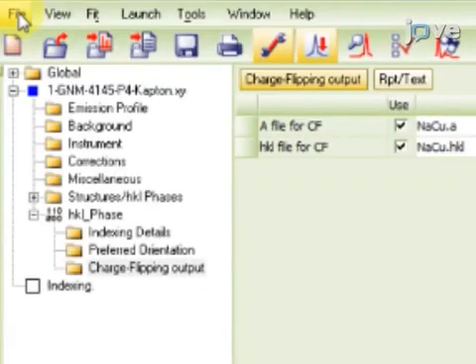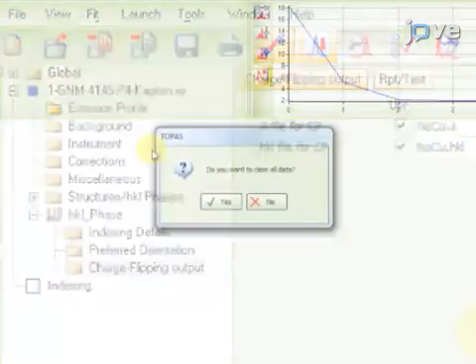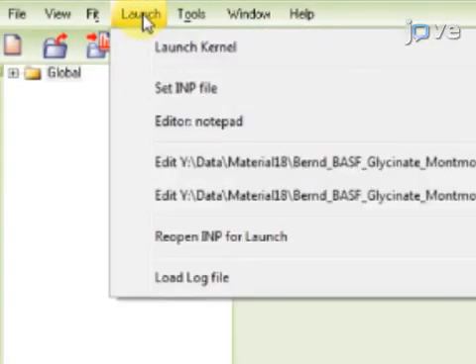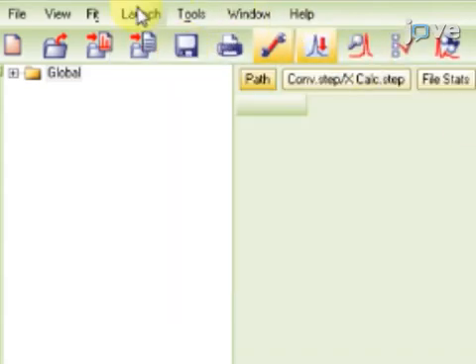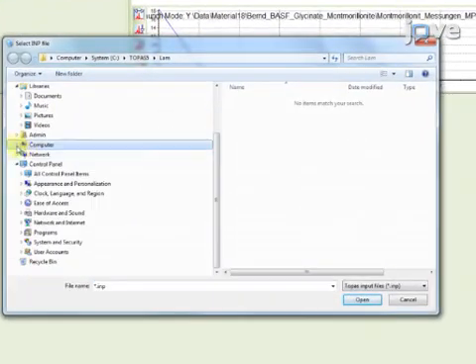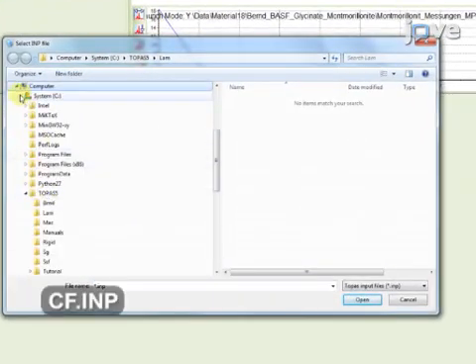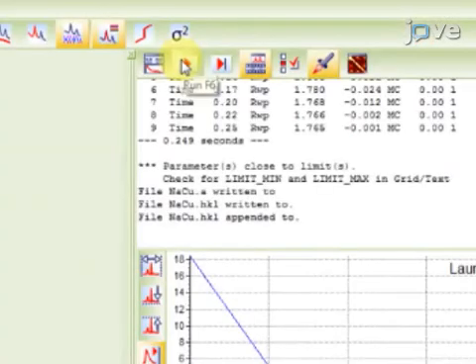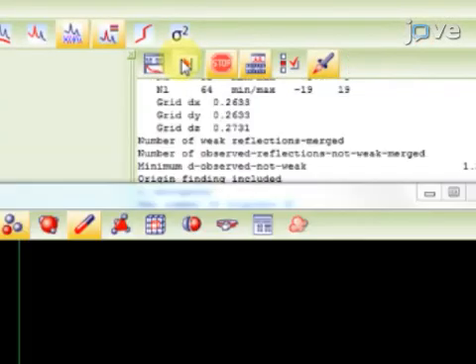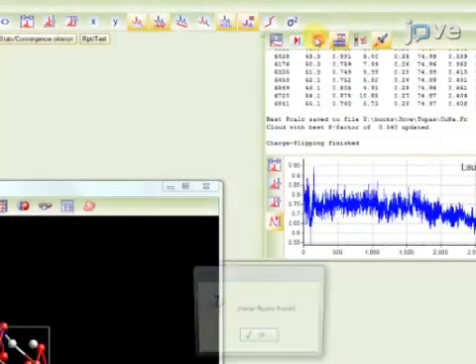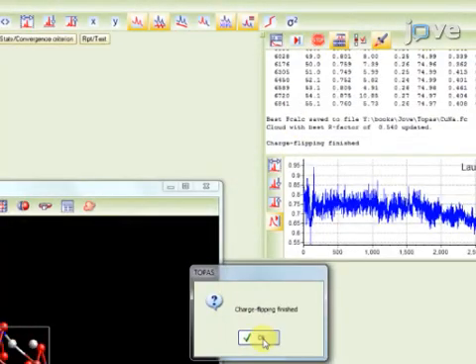First, under File, select Close All, and click Yes. Under Launch, select Launch Kernel. From the Launch pulldown menu, select Set INP File, and then select the prepared input file. Now press the Run button, and after approximately 20,000 cycles, press the Stop button and click OK.